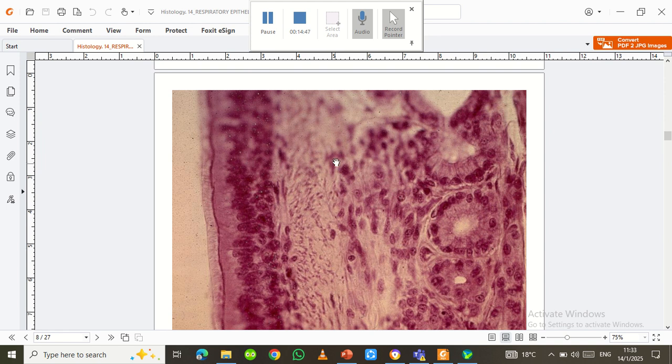And this is your lamina propria. That will be loose connective tissue or areolar tissue, right? And then when you start to see the abundance of these seromucous glands, you are now in the submucosa. So the submucosa is going to have seromucous glands. And then if we continue to go, you're going to have a dense connective tissue of adventitia. You understand? So your pseudostratified epithelia, your lamina propria, this is your submucosa with the glands, and then you're going to have your adventitia.